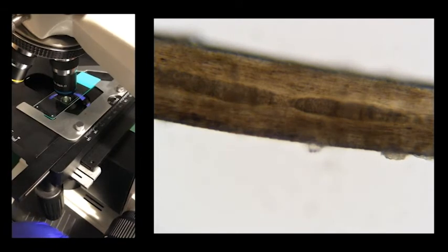We know that by the shape of the medulla and the cuticles, this is likely a human hair. Now let me show you a few samples of some of the other types of hairs that we could find when doing a forensic fiber analysis.